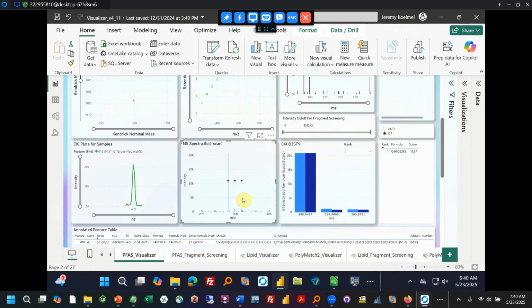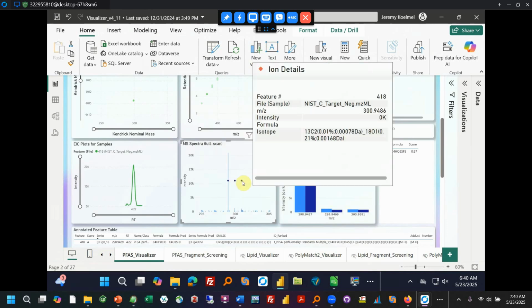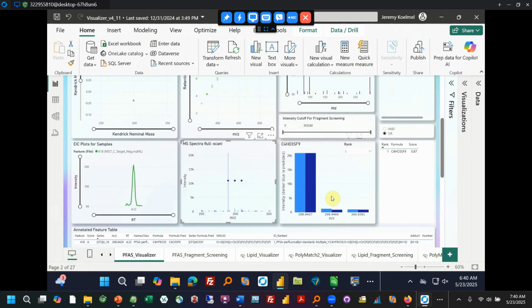The isotopic pattern's good. You will see, if we select over here, the percentage of sulfur will usually be about 4%. So if we look, okay, there's sulfur at 4.47%. So usually we won't see a very big N+2 and definitely not a similar sized N+2 to our N+1 unless we have sulfurs. And then it even gets larger if we have 2 sulfurs. So this isotopic pattern in both of these show that it's likely to contain sulfur.